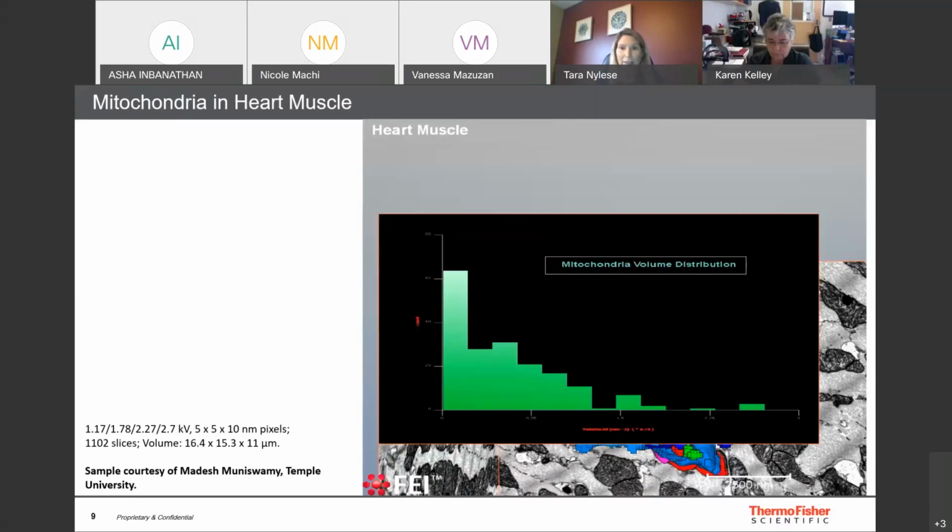And one more comment on this particular work. There have been now many studies on mitochondria and in particular cardiac tissue. And it is a mechanism for understanding any disease state associated in the heart tissue. And so changes in the mitochondria volume itself on an individual one. There is, I'll use the word, puffed up appearance.